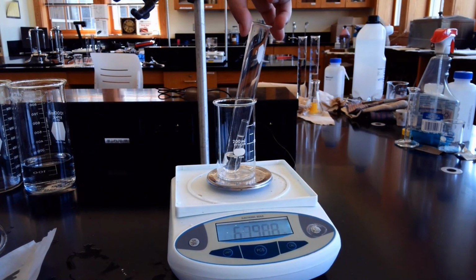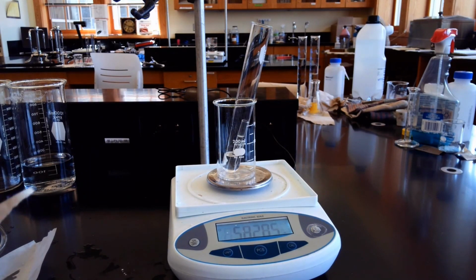So without the water, you are 58.285. 58.285 is the mass of the generator after.